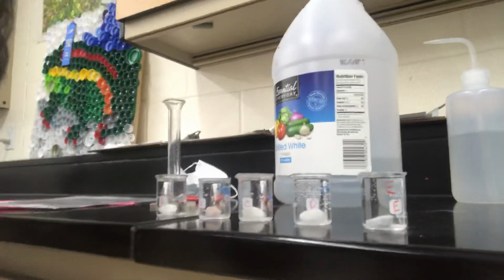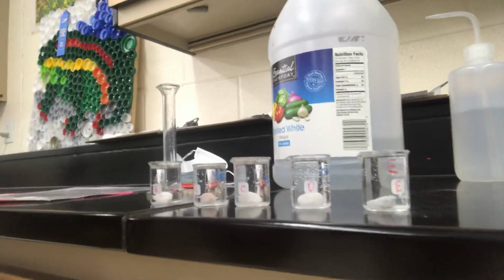And at this point there's nothing you really need to write down, but it's a 24-hour lab where you set it up and then you look at it again tomorrow. So I just thought I would tell you about it now. So the lab calls for eggshells, but we didn't use eggshells. We used little actual marble chips, like pieces of rock, and you can see them here in these beakers.